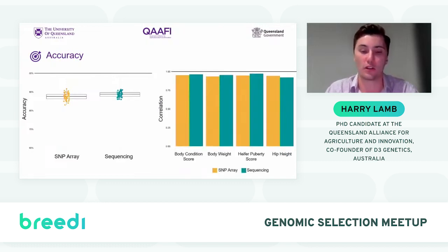Here you can see the correlations we got between the two different technologies, using the SNP array and using our sequencing technology. And these are for 4 different traits that we calculated on farm. The correlations here are between what we calculated either from the sequencing or the SNP array from the lab and the actual, or essentially true, breeding values that we had for these animals. You can see the correlations were quite high for the 4 different traits that we had, which were body condition score, body weight, heifer puberty score, and hip height.